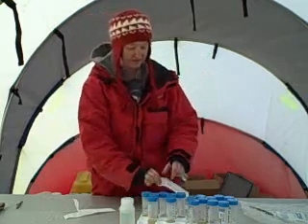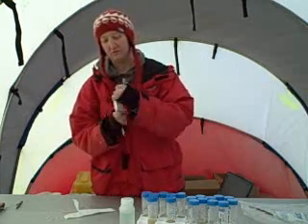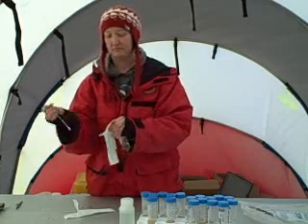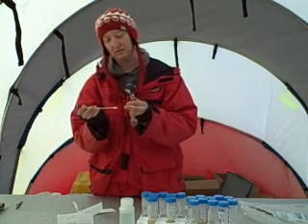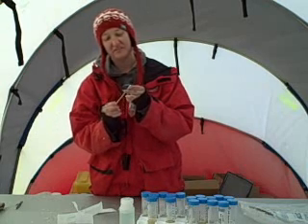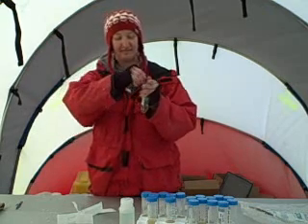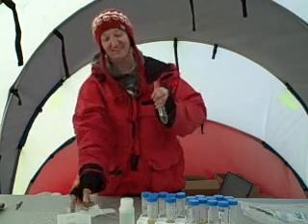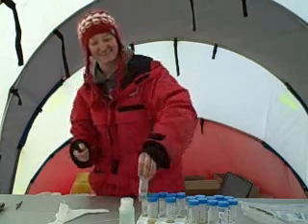Now we have our fingers that are going to go in the warm environment. So we use a different swab. Get a little media on it. Wipe all over my fingers. There's some dirty fingers. And swab it inside. Alright, so in a couple days we'll see if I've got bacteria on my hands.